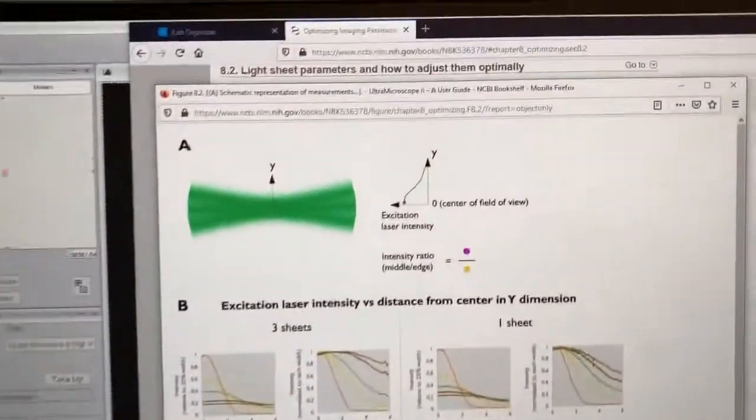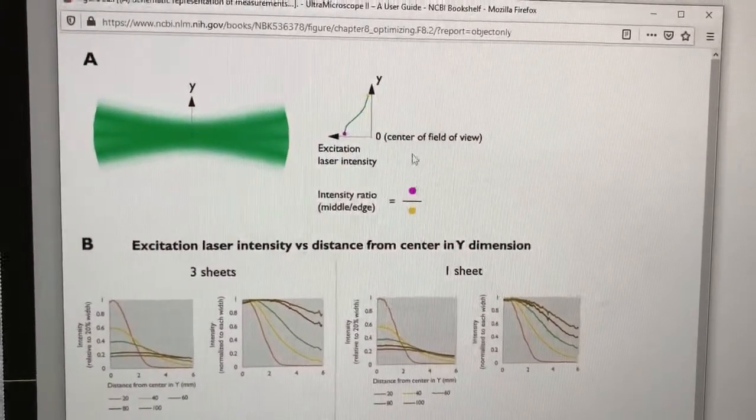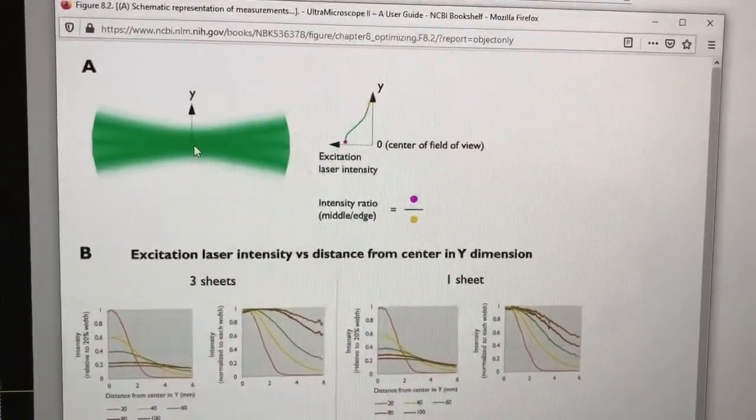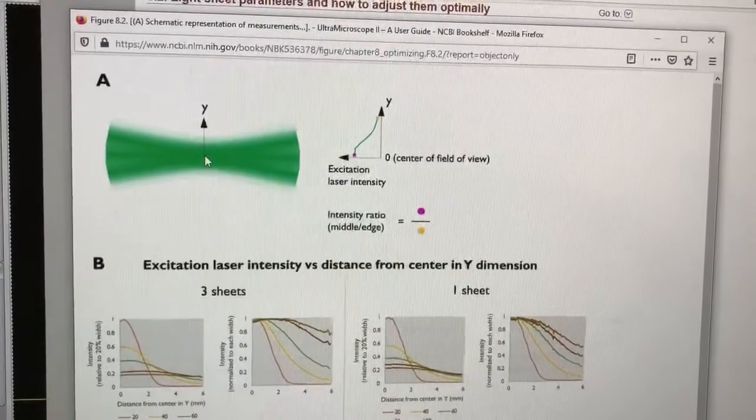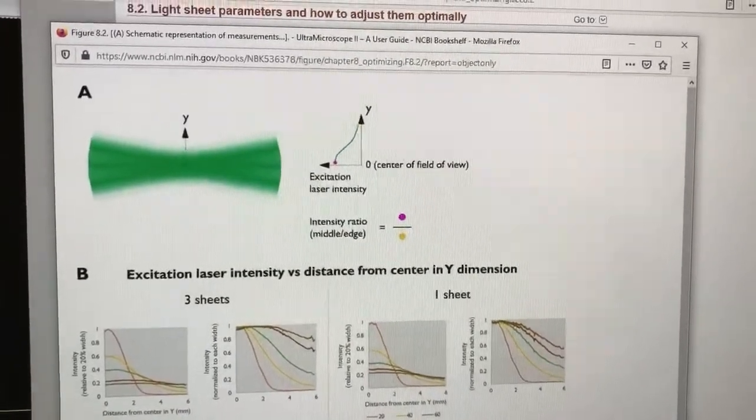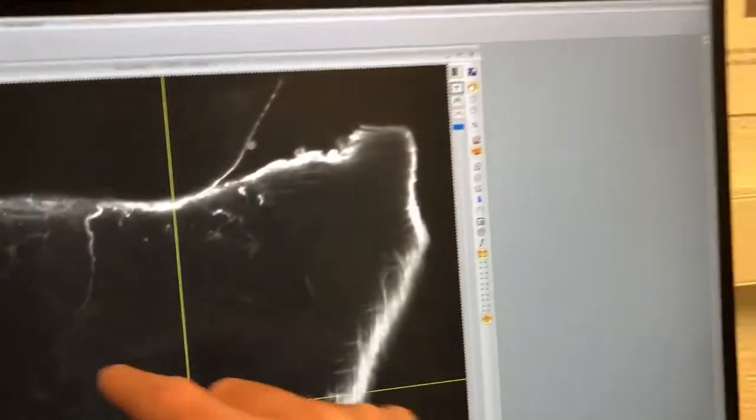So the idea for this is the following: in the very middle in the Y dimension, the light sheets will be brightest, and then as you move away from that they'll be dimmer. So in the middle things will be brighter, and as you move away it'll be dimmer.